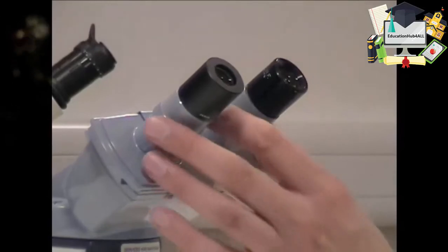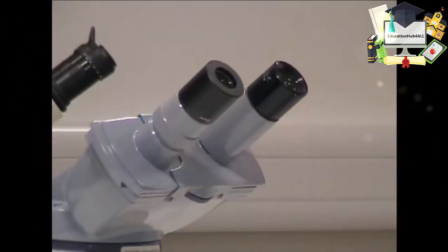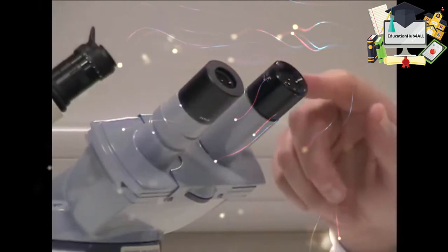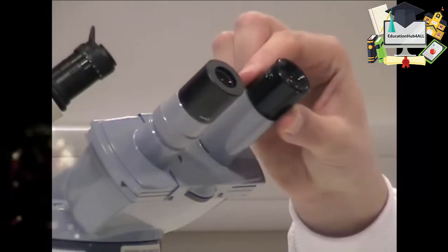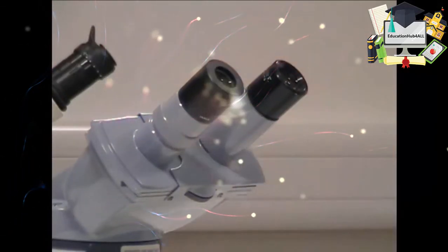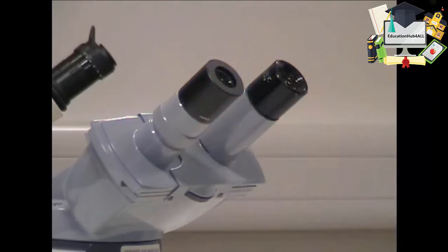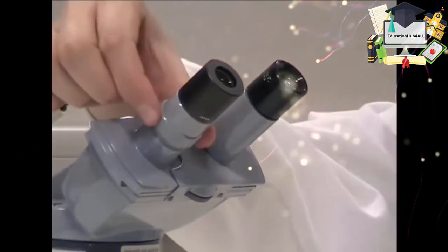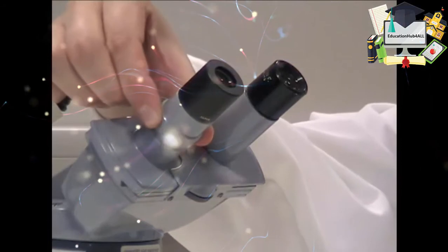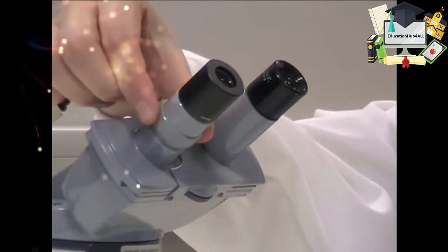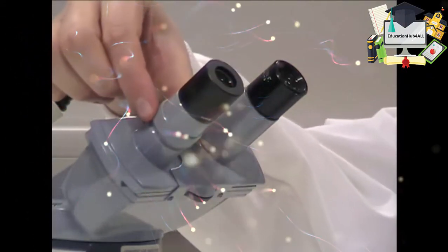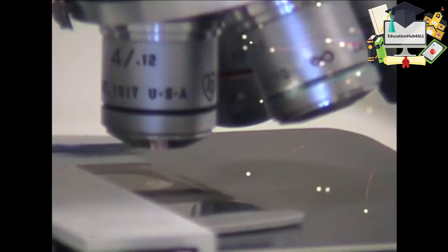If you have a microscope with two eyepieces like this one, make sure that each eyepiece is showing you a focused image. Do this by first looking down just one eyepiece and using the main focusing controls to get good focus and then look down the other eyepiece which has its own focus adjustment here and carry out fine adjustment looking down it with just the other eye. You should now have an in focus image of your slide.